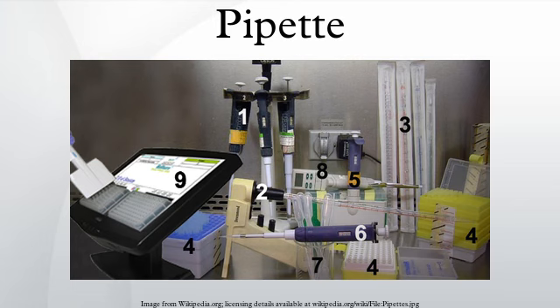Microfluidic pipette. A recent introduction into the micropipette field integrates the versatility of microfluidics into a freely positionable pipette platform. At the tip of the device a localized flow zone is created, allowing for constant control of the nanoliter environment directly in front of the pipette.